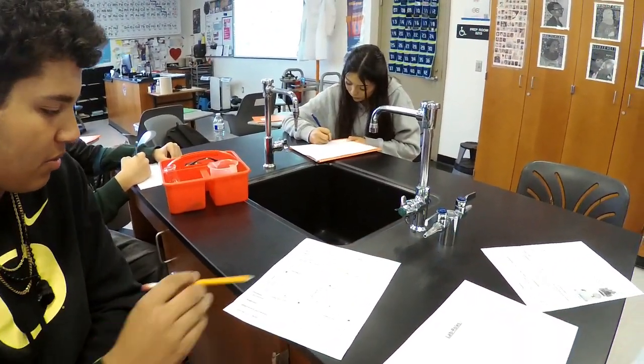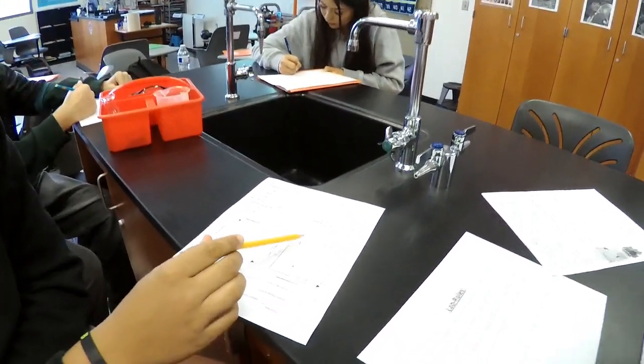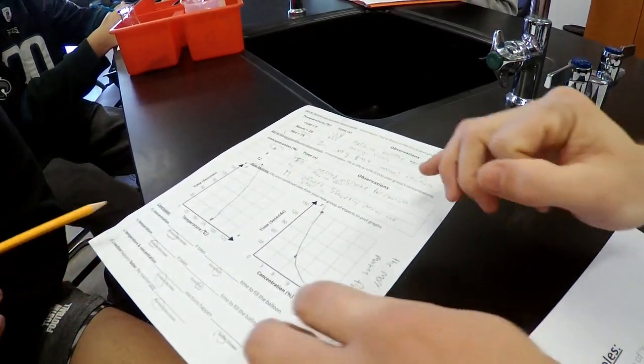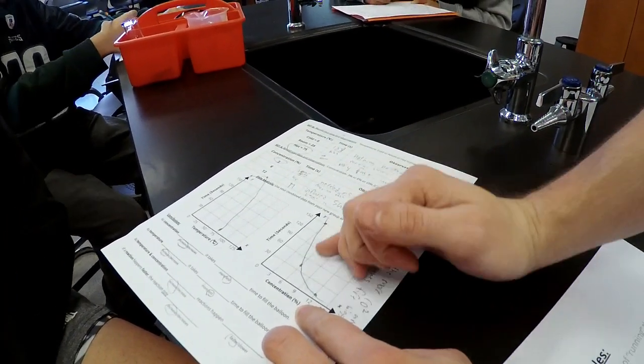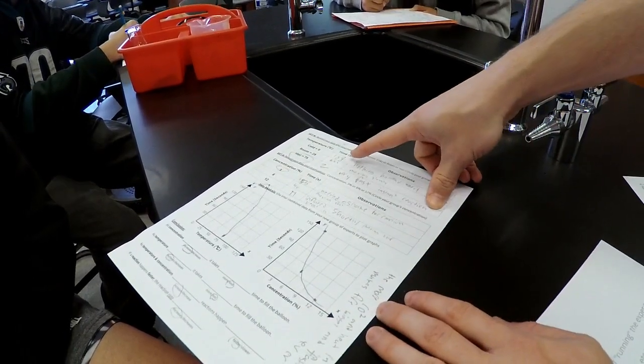And what makes you say that if you were to look back at your data right now? I mean, the room temperature is kind of like threw it off, but if you look at this one, like the reactions are way faster. As we see concentration increasing, what's happening to the time? It's going way faster, so the time's going down? Uh-huh. Okay, cool.